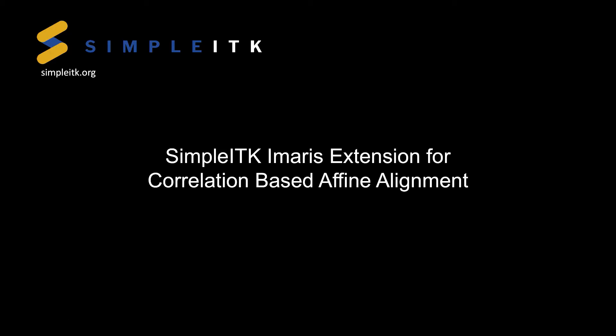In this video, we show how to use our Python Imaris extension for affine correlation-based registration.